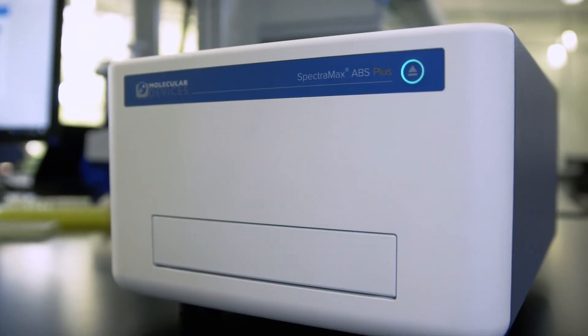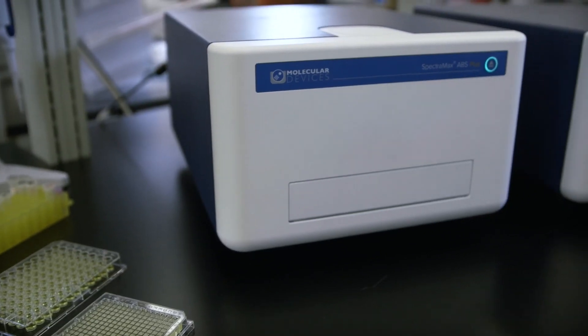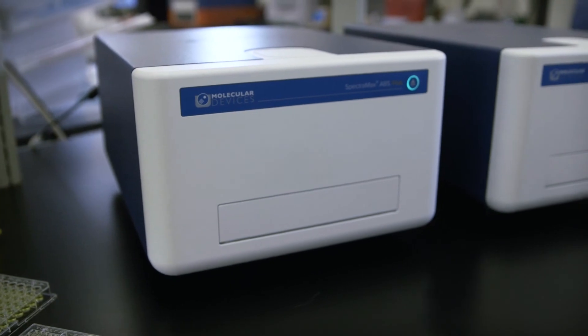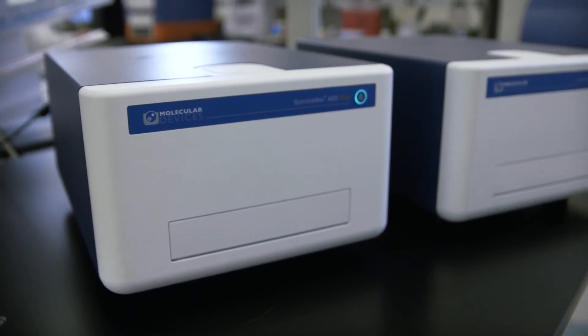Small but mighty, the SpectraMax ABS series has everything you need in a microplate reader, sized and priced to fit your lab.